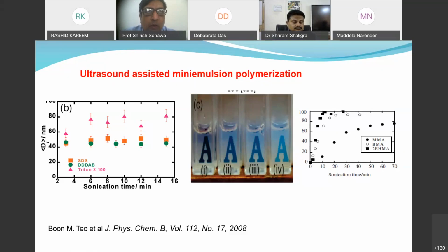As it is more hydrophobic in nature, we can carry out inorganic nanoparticle encapsulation into this polymer during this mini emulsion polymerization. So you can now understand the different advantages. First, there is no need to use an initiator. Second important thing is latex size: you can obtain polymer latex in the nanometer range using ultrasound cavitation.